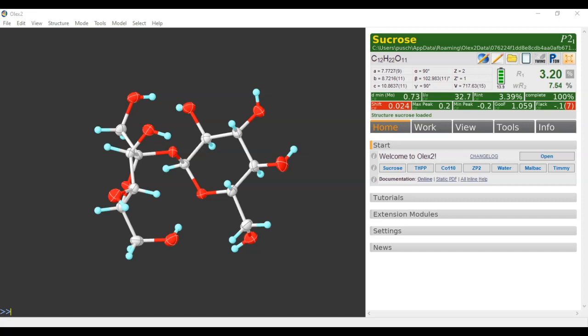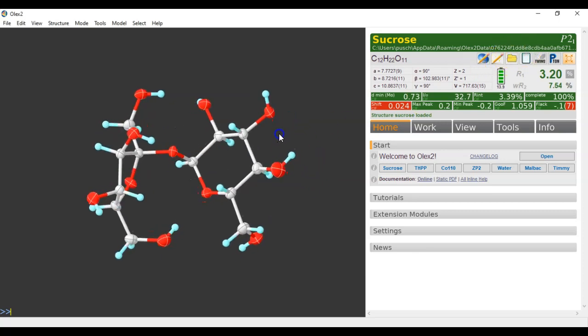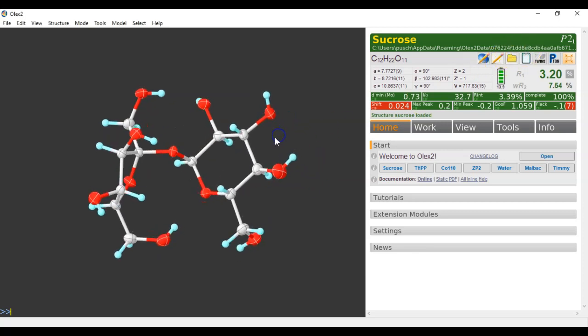Here's a little bit of a strange use of Olex2, but some of you might find this useful. I've got a structure in P2.1, it doesn't really matter, but I can save this as file ex4export.xyz. There we go. So it's now exporting the sucrose structure as an xyz file.